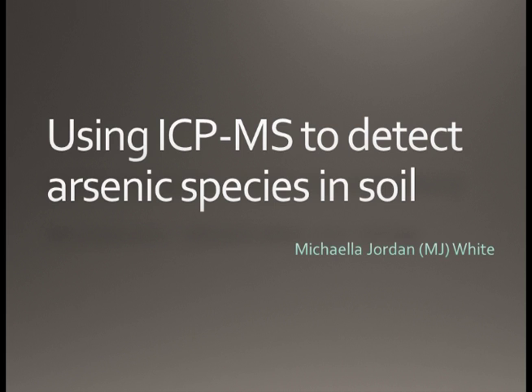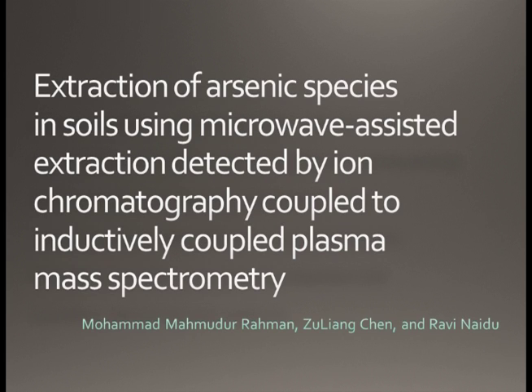The main research that I'll be covering is in an article called Extraction of Arsenic Species in Soils Using Microwave-Assisted Extraction Detection by Ion Chromatography coupled to Inductively Coupled Plasma Mass Spectrometry. And this research was done by Rahman and Associates. So first let's cover some background.